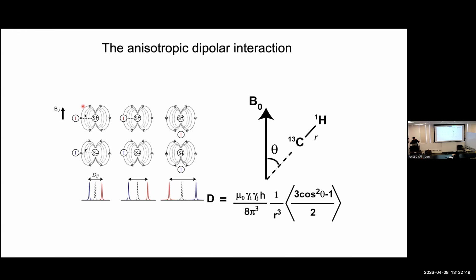I would like to partially align it so that it's not tumbling, it's not sampling every orientation with equal probability. Currently, my molecule samples every orientation with equal probability, but I want to break that. How would I do it? How would I align my sample? What do I do? No, but that would be the obvious answer. Give me a more interesting answer. Or tricky.